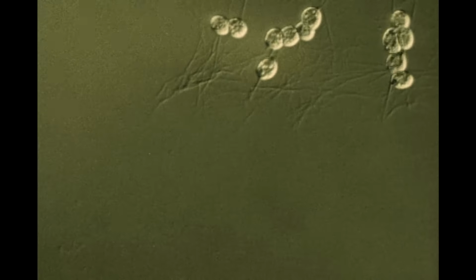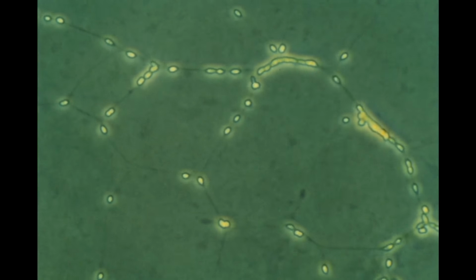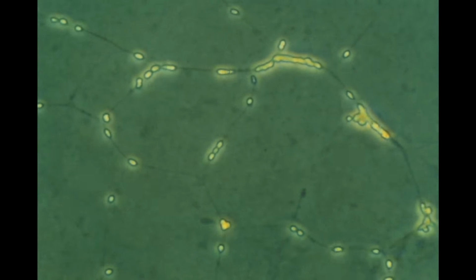The mechanism by which the individual cells move is not understood. There are no specialized locomotory structures, such as cilia, flagella, or pseudopodia. The speed of movement varies in different isolates from a few to hundreds of microns per minute. This scene has been speeded up 700 times.